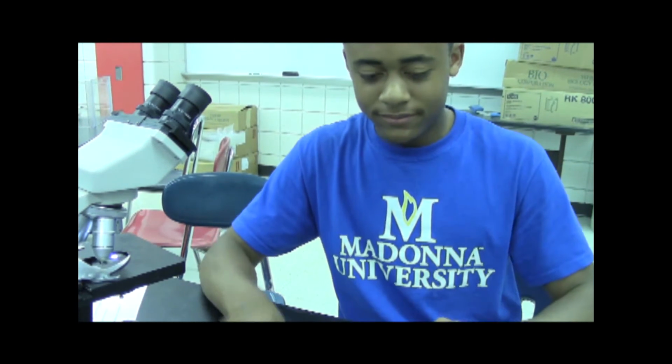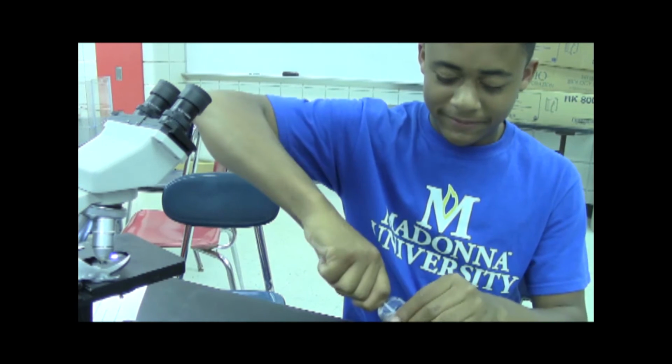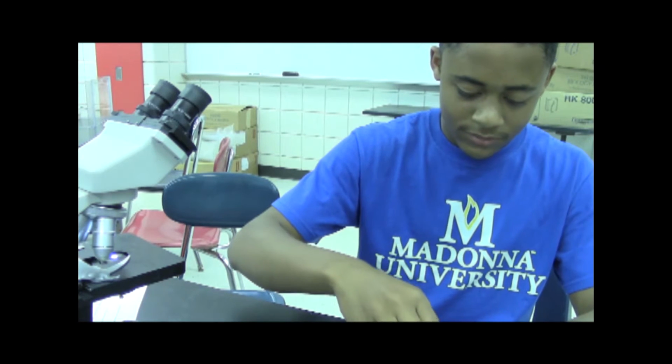When casting a hair, you need 4 essential things: slide, tweezers, nail polish, and of course your hair. First, you want to start out by applying 1 small line of nail polish, as such. Next, take your hair and gently lay it down across the nail polish.